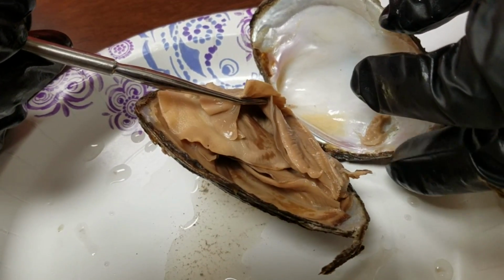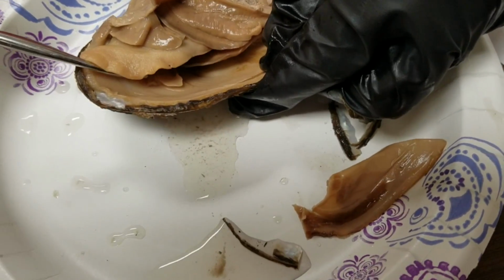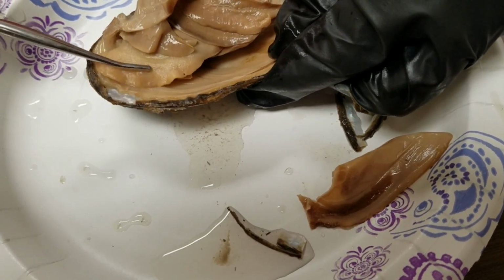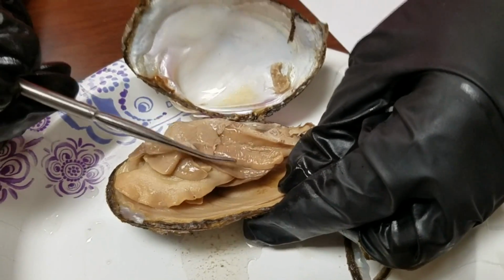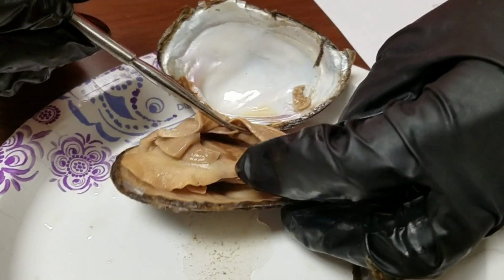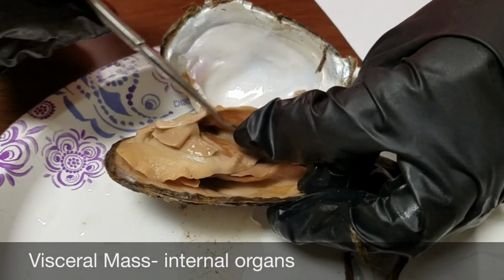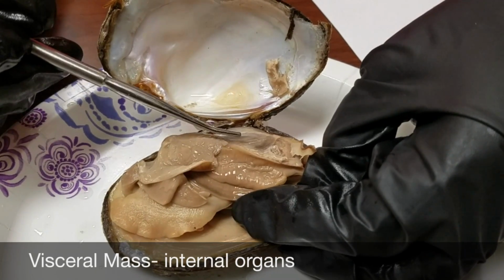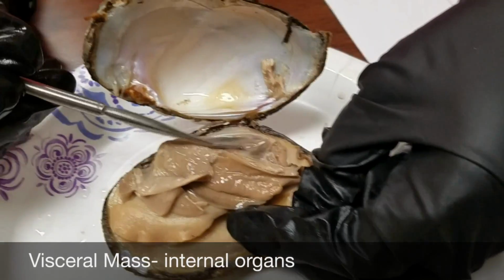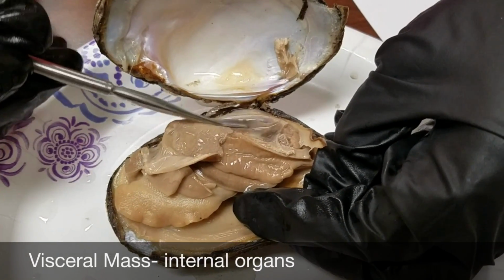Then you have this big thing. This is probably the most noticeable feature, and if you touch this part of the clam, it's real squishy. So above the gills you'll find the visceral mass, and it's real squishy and squashy.